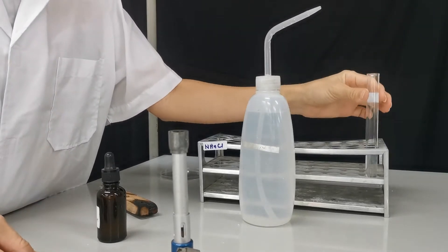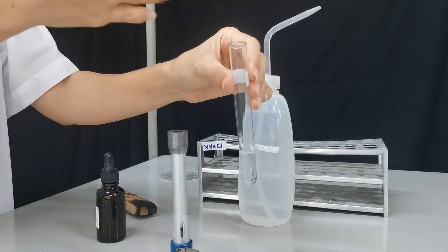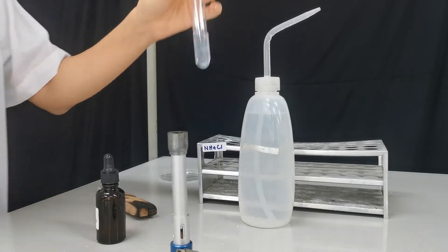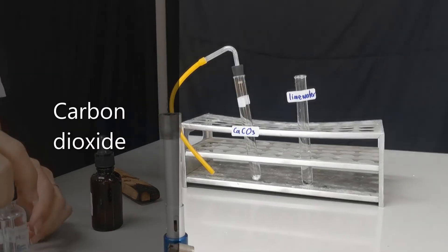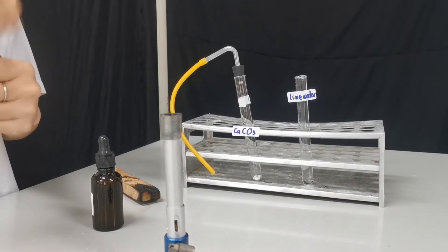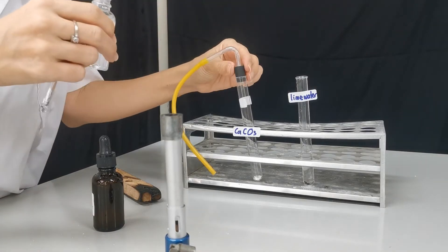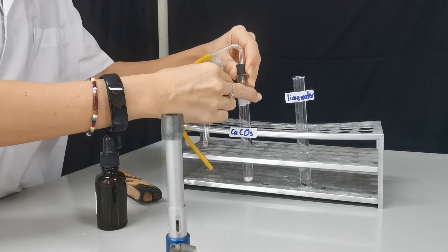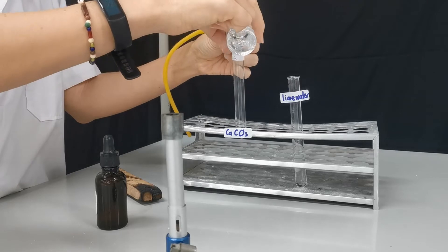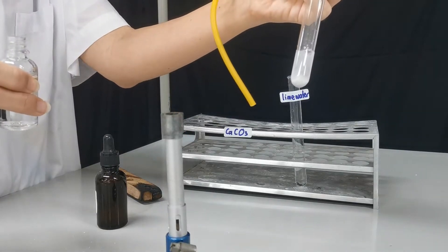You can also smell the ammonia — you waft it like this and you should be able to smell a pungent smell. For the second test, we're going to test for carbon dioxide gas. We can produce carbon dioxide by reacting any carbonate with hydrochloric acid. Here I have calcium carbonate and I'm going to react it with hydrochloric acid — you can see the fizzing happening.